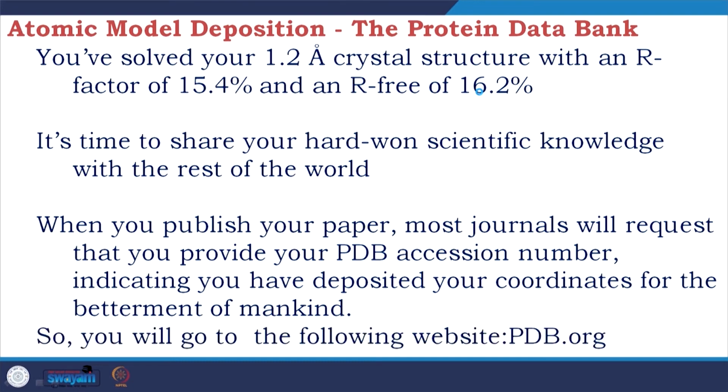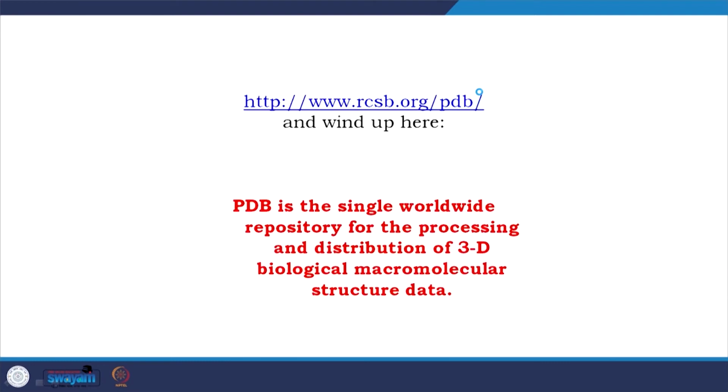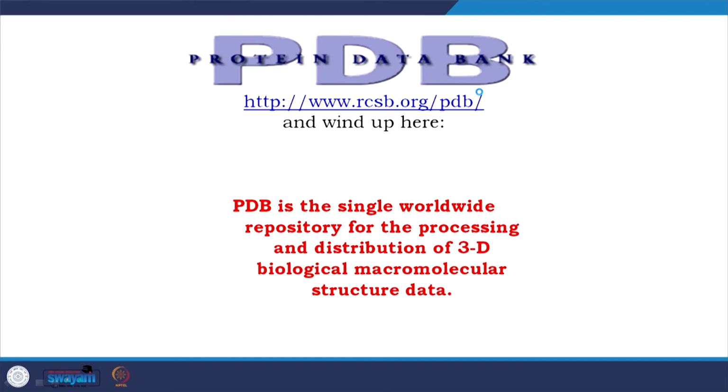So, then you go to the following website pdb.org, we will talk about. So, this is protein data bank, and PDB is the single worldwide repository for the processing and distribution of 3D biological macromolecular structure data.